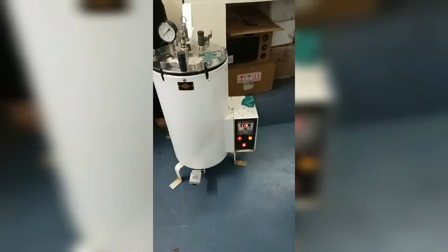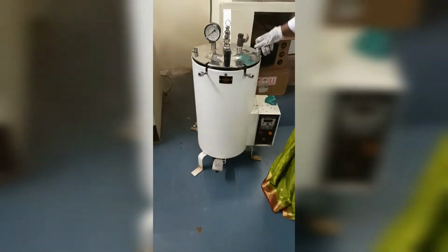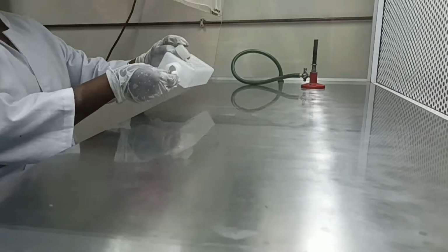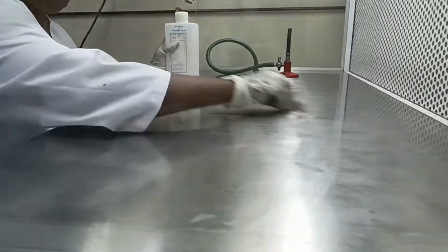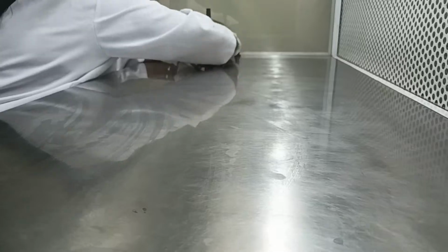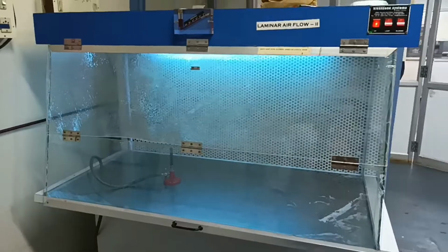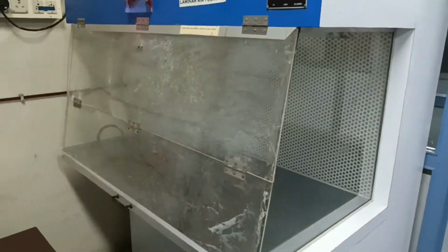After finishing the process, loosen the screws. Take the medium and petri plates for working. Laminar airflow chamber. Wipe the chamber using 70% ethanol. Switch on the UV light for 10 minutes. Switch off the UV light.